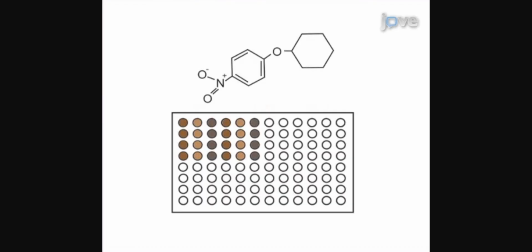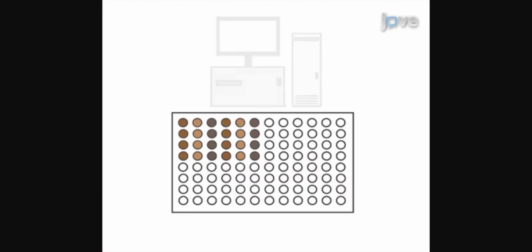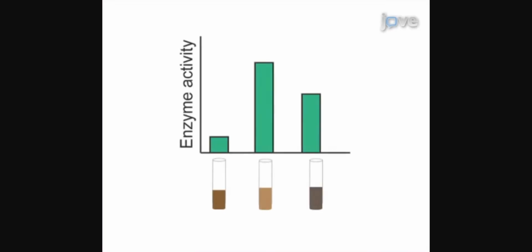As a second step, artificial colorimetric or fluorometric substrate is added to the microplate wells, which allows for enzymatic reactions to occur. Next, either absorbance or fluorescence is measured in order to determine the amount of end product released during the reaction. The results show differences in extracellular enzyme activity between samples based on the absorbance or fluorescence of the final reaction.